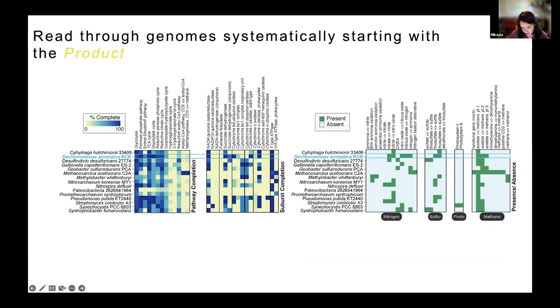So these are the photosystems, and it's true for one of my genomes. Or if I'm really interested in methanogenesis, I can tell right away which genome I might need to be looking at. Again, this is only for 15 genomes, but you can imagine that if you had thousands of them and you only cared about methanogens, you can immediately pull out those methanogen genomes.